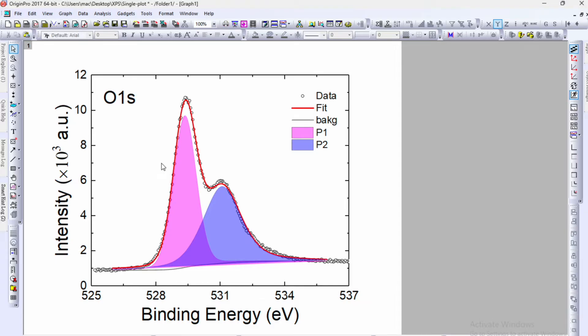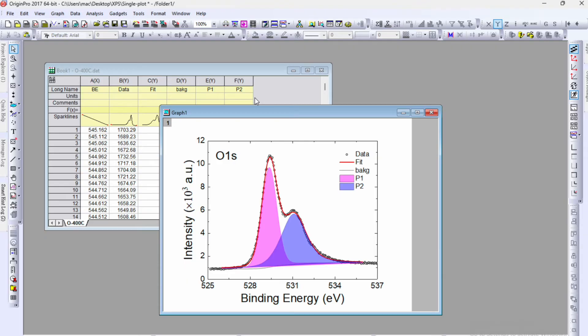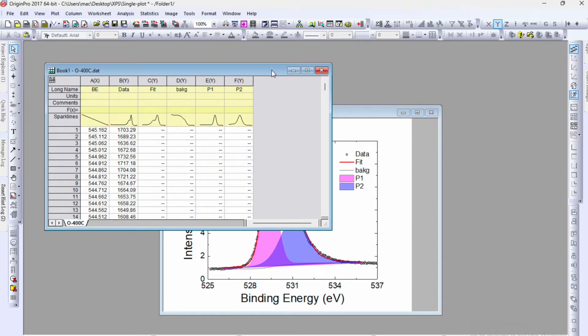In coming few days I will upload another video on how to do the deconvolution. So in this case we have total two peaks within one XPS spectra of Origin O1S.